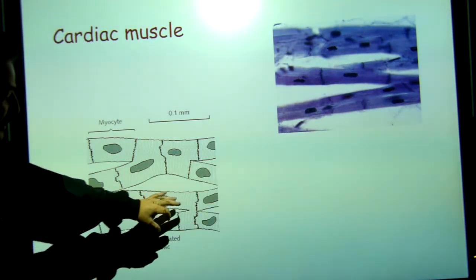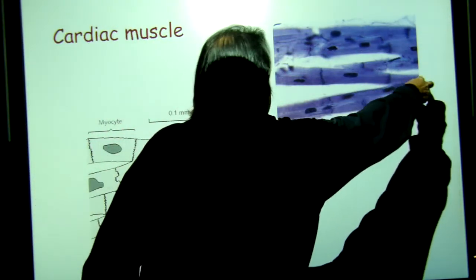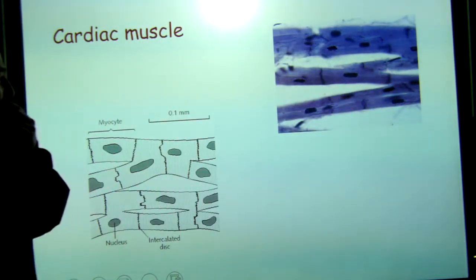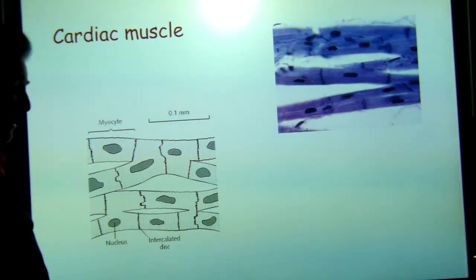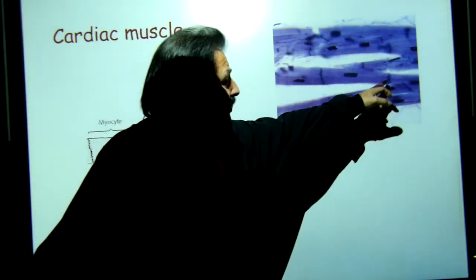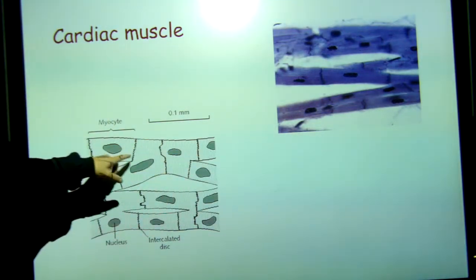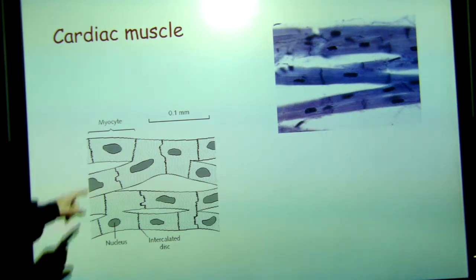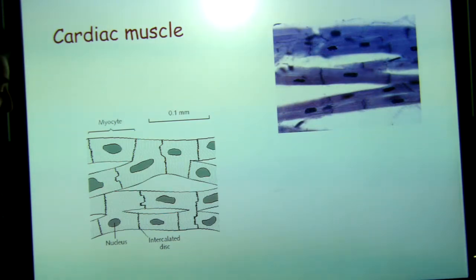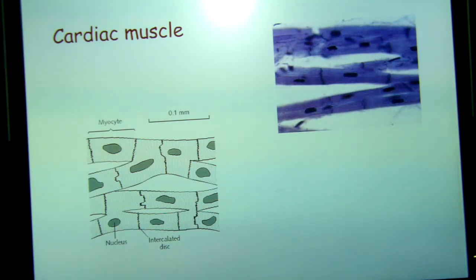So where you see this convergence or forking, depending on which way you're looking, if you're going this way, it forks out into two. If you're going this way, it converges. All right. Another telltale sign of cardiac muscle is these very, very dark lines that seem to divide the muscle up into strange little cells that are not always the same shape. You look at this one, it looks like different plots in a housing development or something like that. Down here you got more elongated ones.